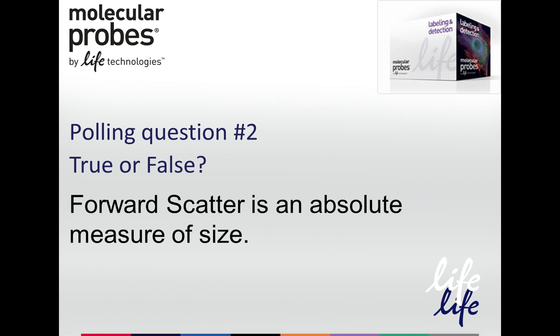All right, so we have 83% of the responders correctly identified this answer as false. Forward scatter is not a volumetric measurement, and it can only be used for a rough estimate of size.